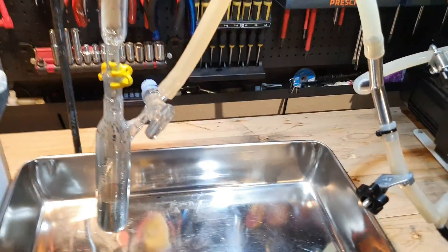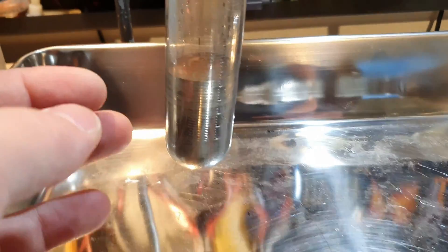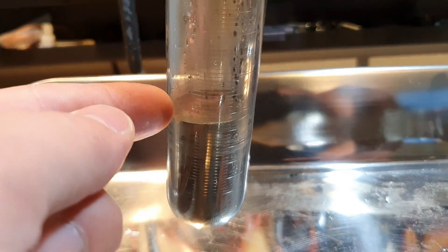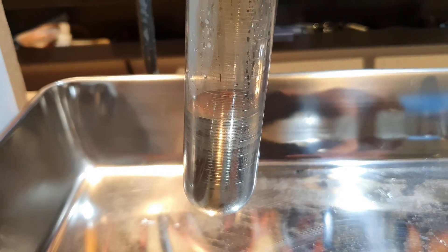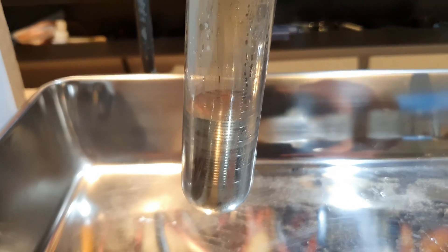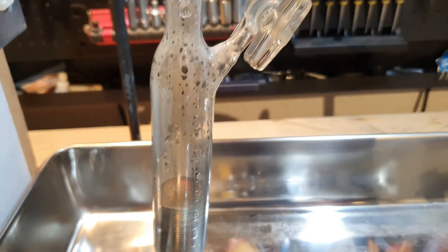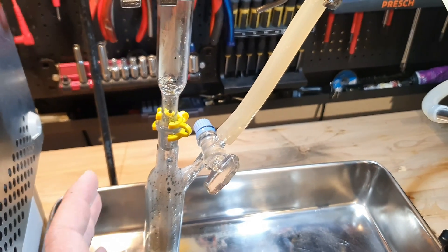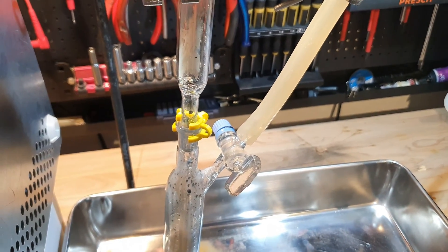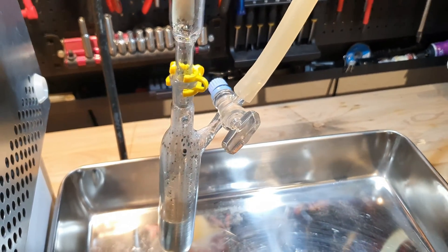The cesium production is now running for about an hour, and the yield is already higher than it has ever been. But I'm trying to push the 35 milliliter mark here, which would give us a yield of around 80%. The cesium drip rate has slowed down significantly — there may be one drop every 30 seconds — but I'm trying to get it to 35 milliliters.